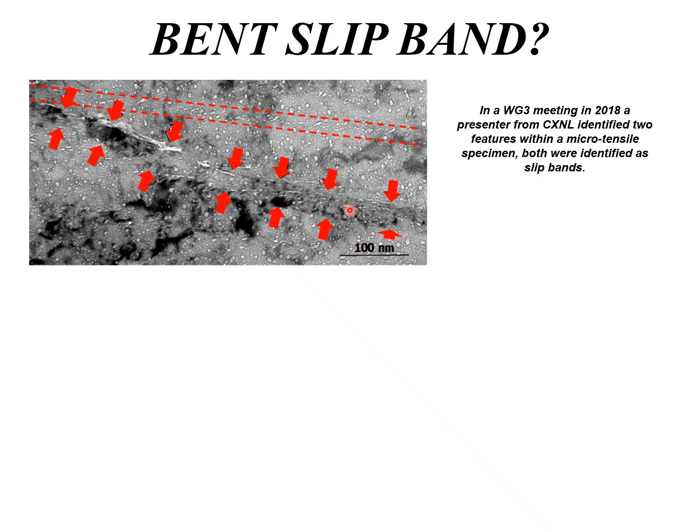I've seen this scientific advisor of the UK government come and give a presentation at Chalk River, and he showed some little loops, which he said were punched out loops in an arc, and I pointed out that can't be. Those are not loops. I don't know what you are. You're looking at the end of a subgrain boundary or something, but those are not punched out loops.